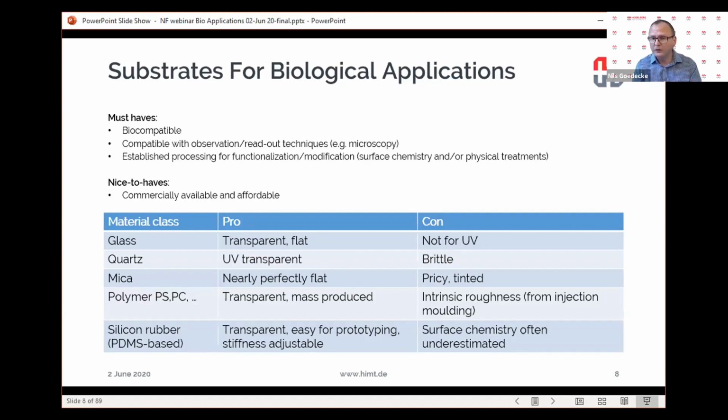But there are also flexible materials that can be used for structuring, and silicon rubber like PDMS, probably we would use after we have structured a surface, but we could use that for molding and demolding. There are also methacrylate hydrogels, but this would not work. So anything, people ask what materials can you use with the NanoFrazor? I keep on saying, if it is flat and we can spin coat it, bring it on. We can basically work it out. And that gives us quite a bit of opportunities.